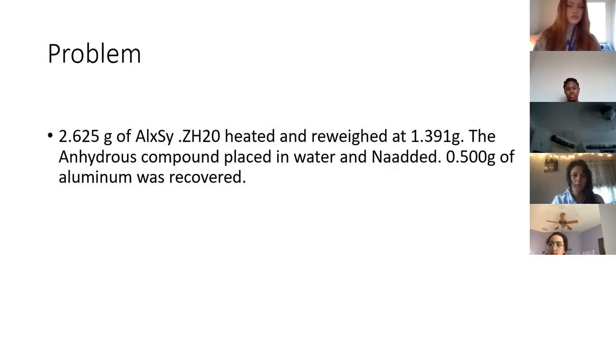The 2.625. Does that give me the weight of aluminum, sulfur, or water? That gives all 3. There's something in there, Abhishek, that you can tell me right away what the weight is.